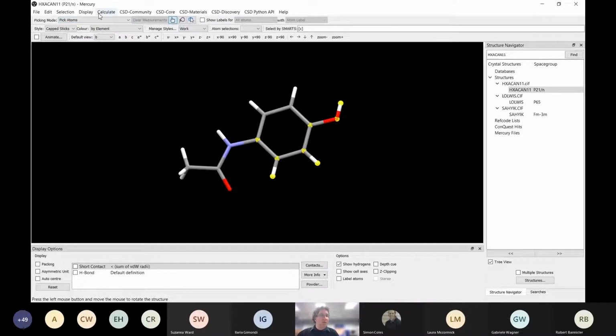If you don't want the selections you have, the easiest thing is click in selections and do deselect all. And again, just going for this menu, you've got a few options. So you can select all of them, you can select molecules, and so on, and there's some select options. Quite often you might not want to do the hydrogens, or you might just want to look at the hydrogens, so we can go through. If I do non-hydrogens, you see, leave the hydrogens, and we can invert and so on. So there's a whole load of ways you can decide what you want to select. That's fine, but for the moment, I'm going to do deselect all.